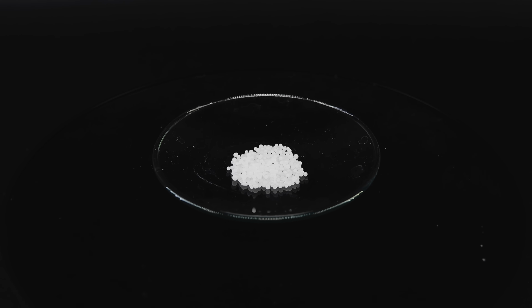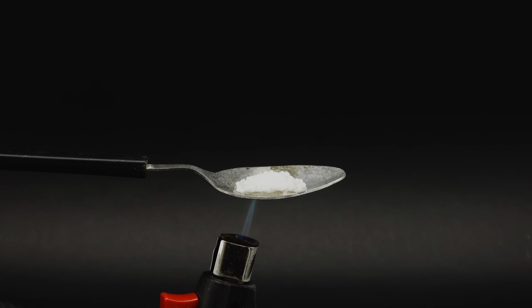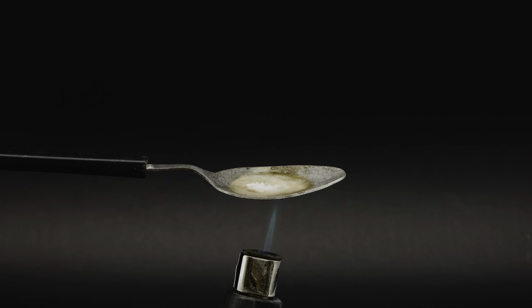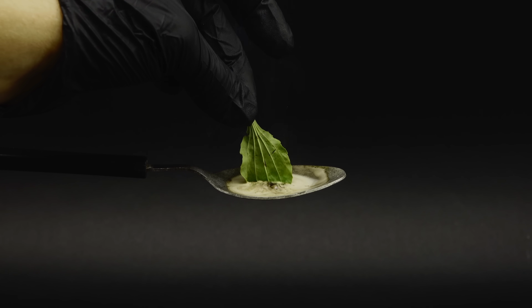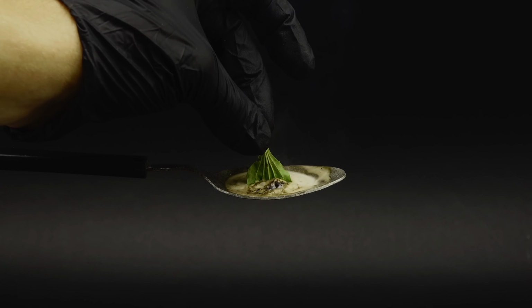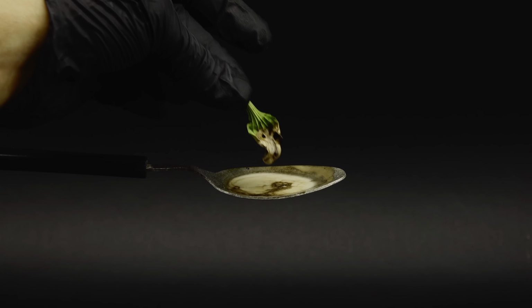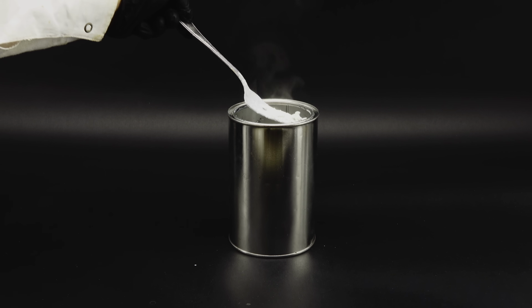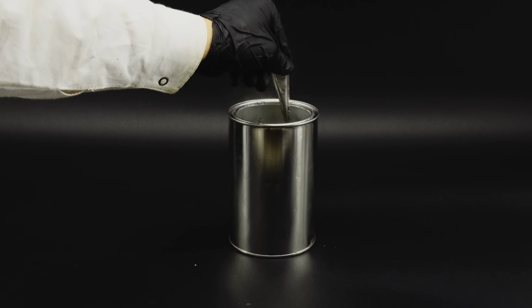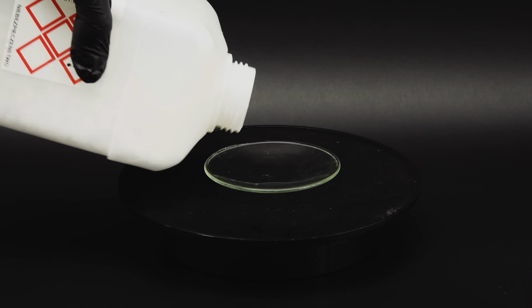What's different about it, however, is that heating the hydroxide to 200 degrees Celsius won't work, and it basically has to be molten. You can imagine just how corrosive and dangerous that is, and since sodium hydroxide melts at a whopping 323 degrees Celsius, I won't even be able to use my electric stove. This also creates another problem, since at such high temperatures the sodium terephthalate would just decompose instead of becoming benzene, which is not cool.